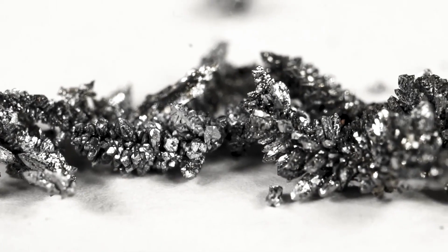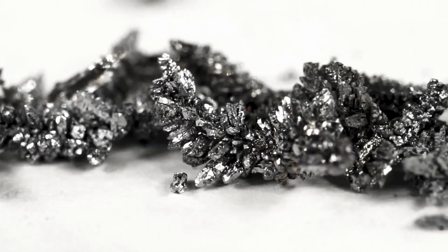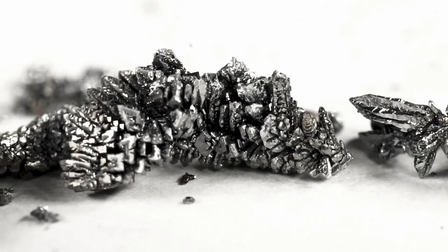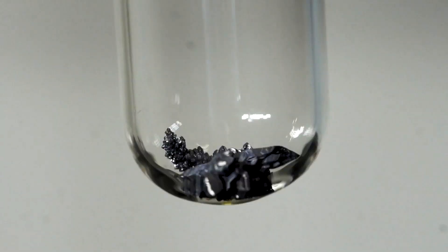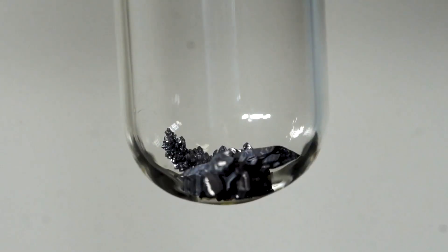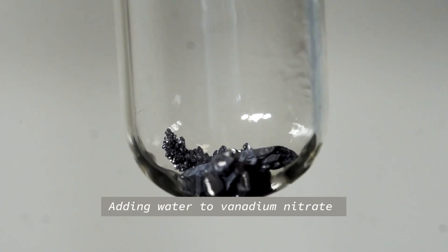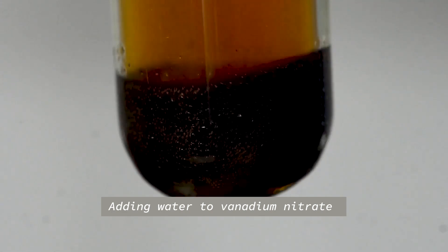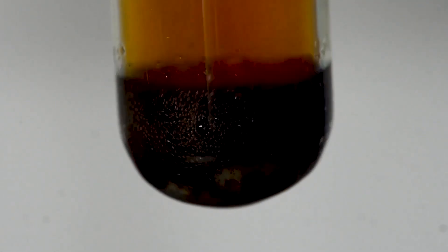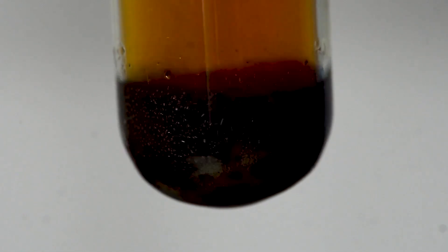As a warm-up experiment we are going to add concentrated nitric acid to vanadium crystals. This reaction is a little violent and as we pour in the nitric acid you will see vanadium 5 nitrate being produced and nitrogen dioxide emitted. Then we will add some water to this to produce a solution of vanadium 5 nitrate.